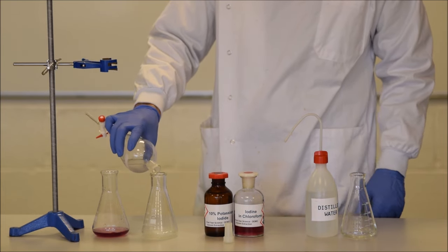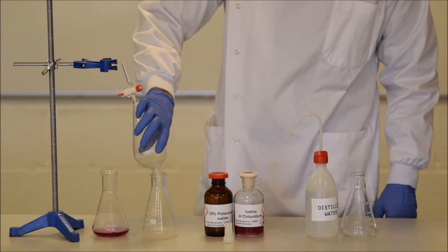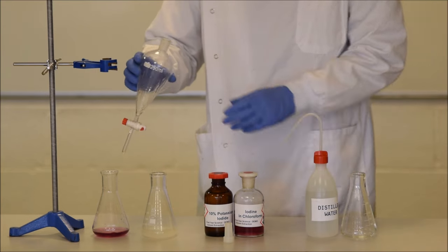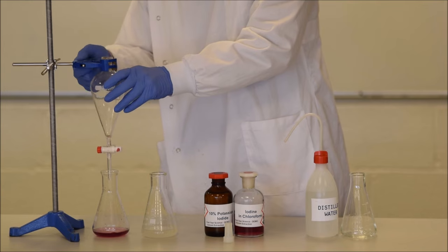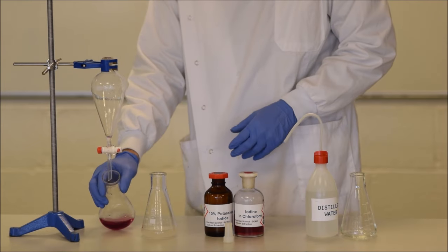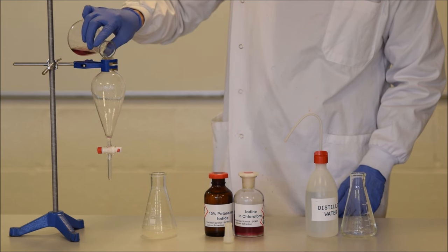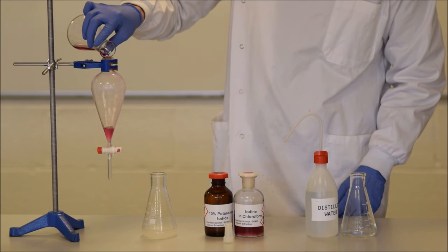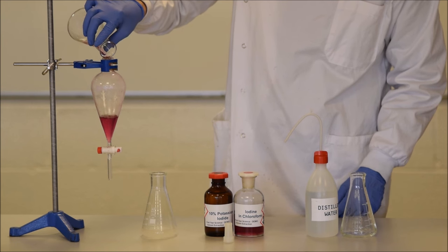Simple as that. Once we've emptied our separating funnel, we can put the chloroform back in again because we want to have another go at extracting it. This time we're going to use something a little bit different. We're going to use a solution of potassium iodide. Potassium iodide, as you'll know from your lectures, contains I-. And the I-, or the iodide, is going to react with the iodine to form I3-, which is polar and of course soluble then in water.